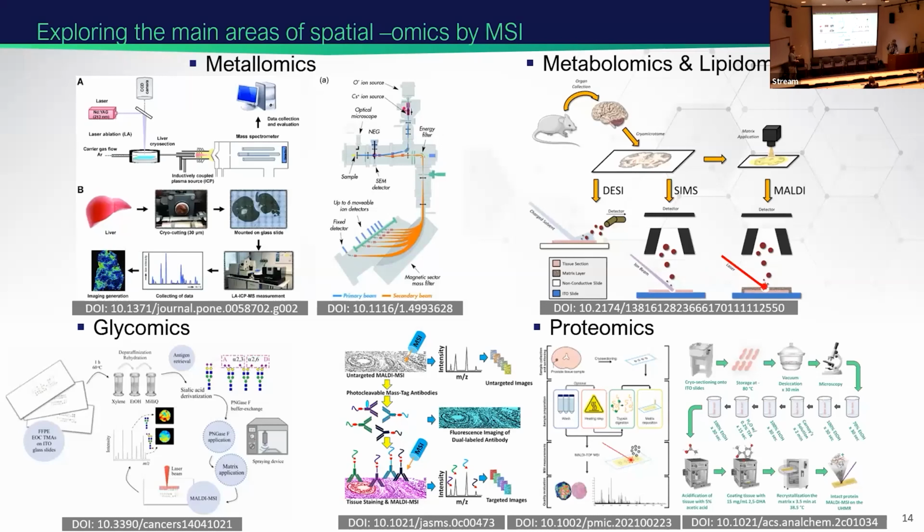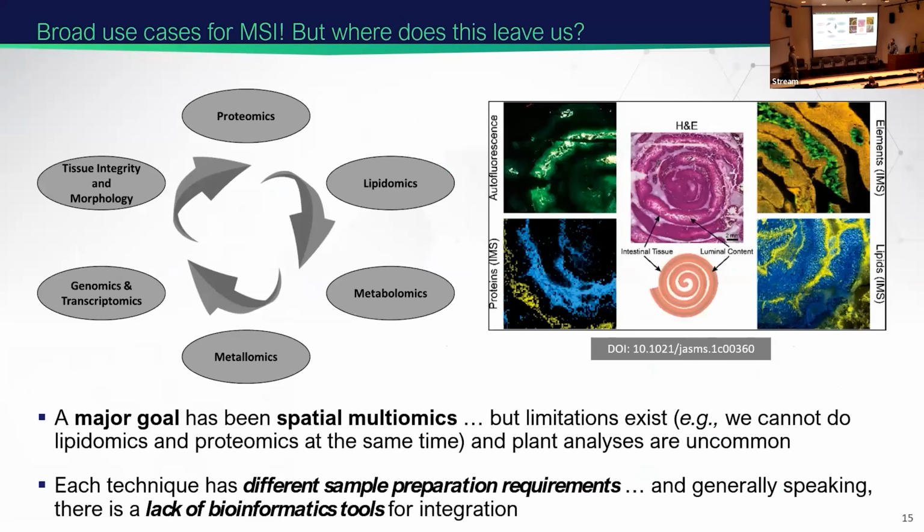And if you're ever interested in any of these techniques or how they can actually apply to your research, please reach out to us and we should be able to go ahead and guide you. And we'll talk a little bit more about the sample preparation for each of these in a little bit, but there is some universal sample preparation, and we can actually combine a lot of these different modalities together. So when we really think about actually combining these modalities, you might see that there's actually going to be intestinal tissue on the right-hand side.